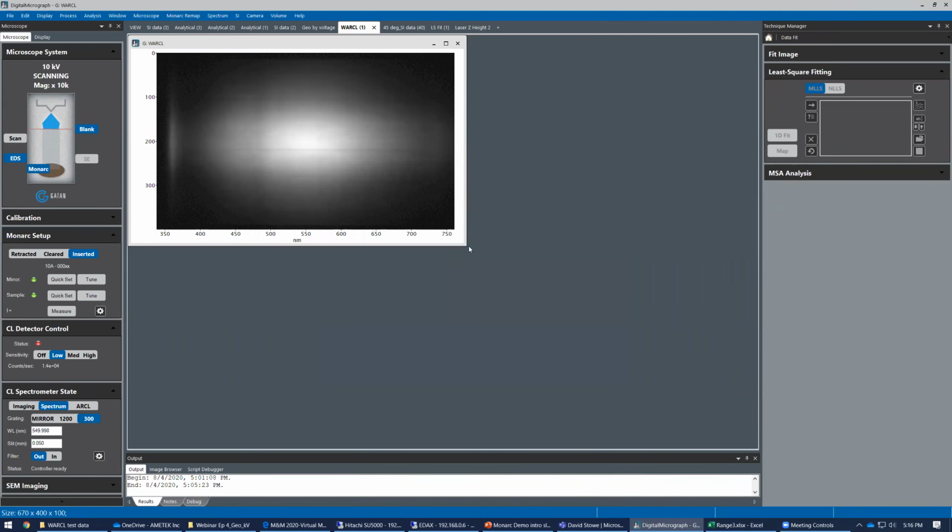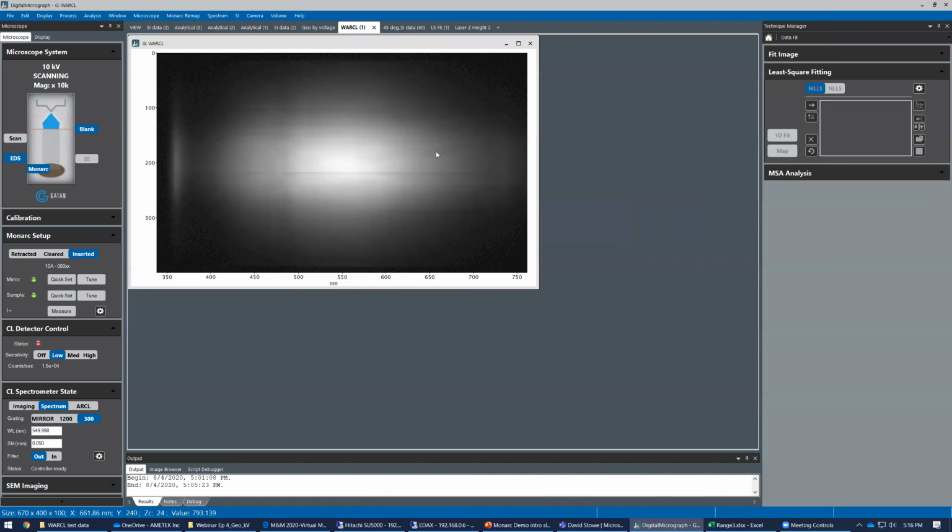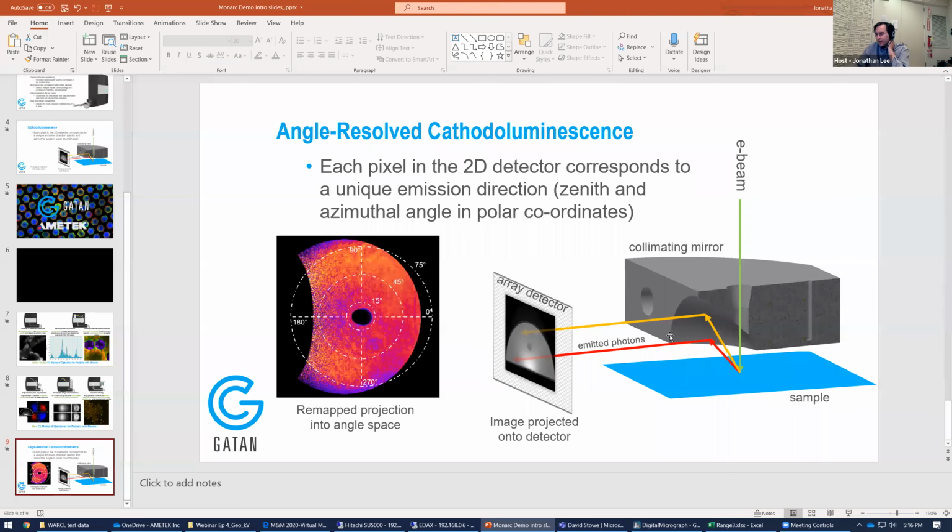And you mentioned the Y dimension. Is this the thing that would get cut off by the slit? As you narrow down the slit, the Y dimension would get cut off? In wavelength and angular CL data, what we do is we project the light straight back, and then we take the slit and cut the light so that only a small portion of it passes through, but it's still a projected image of the back plane of this parabolic mirror.